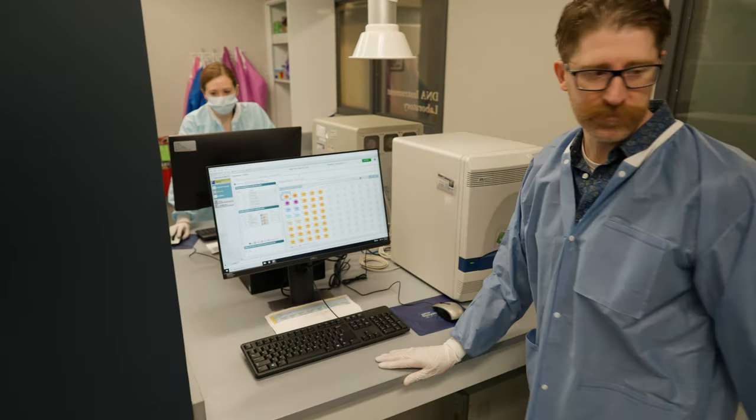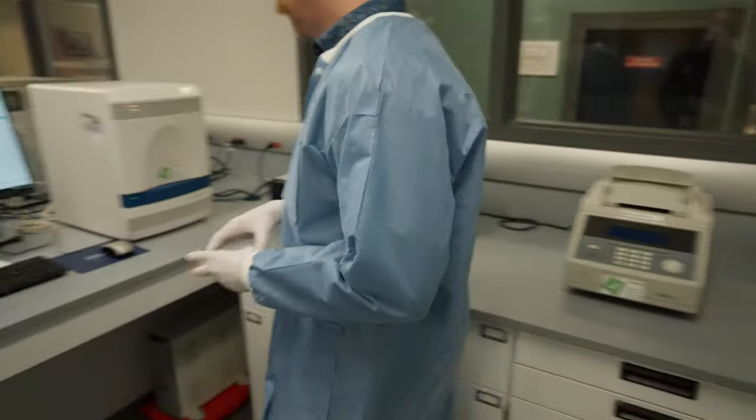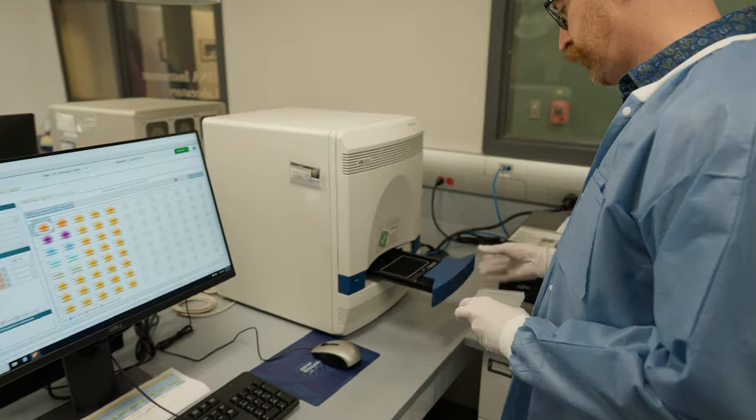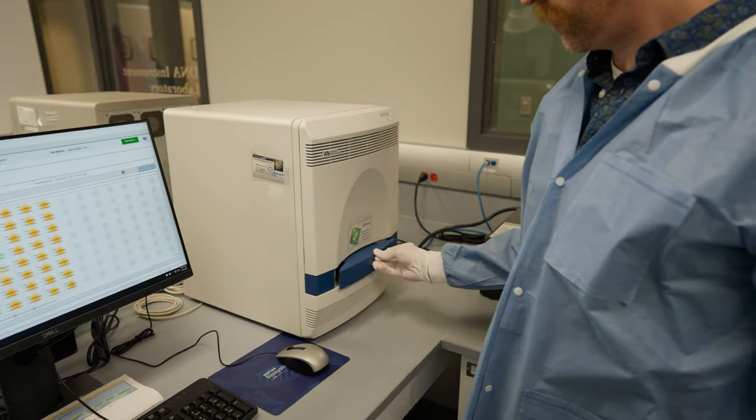As the quantitation reagents copy certain areas of the DNA molecules in the sample, a fluorescent signal is emitted. The relative brightness of the signal is measured by the instrument and is converted into an estimate of how much DNA is present in each sample.